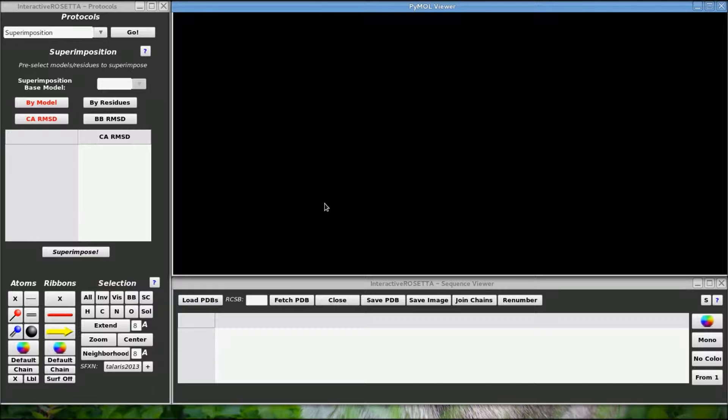First you need to get the structure of the antibody. Normally we start off by loading a structure, but this time we don't have a structure and need to predict it, so we can skip that step.